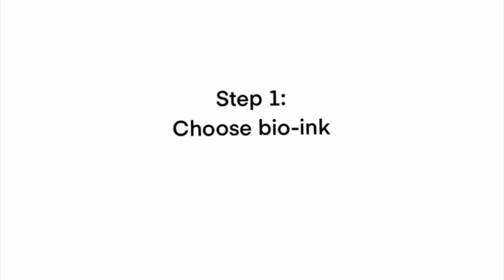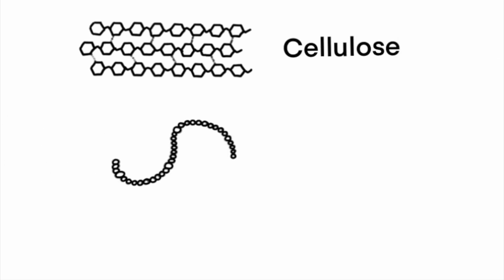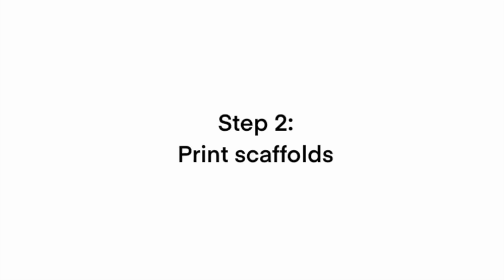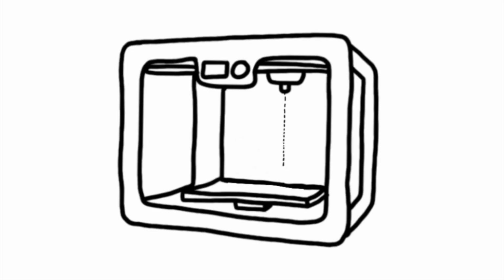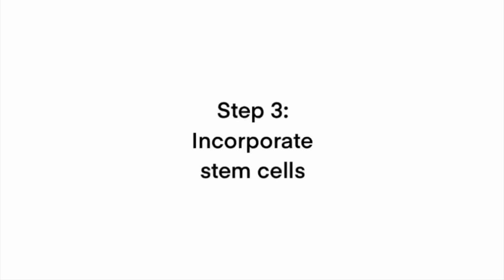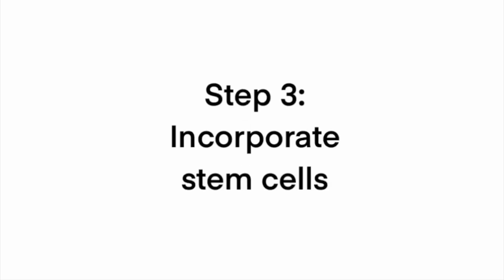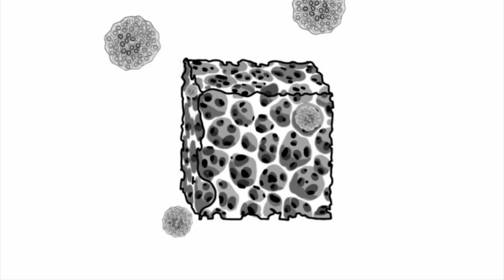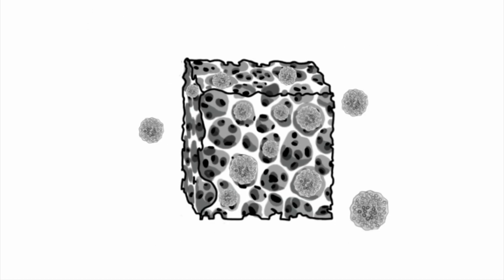Step 1. Choose your bioink. These are natural or synthetic polymers which will form the base or scaffold of the bioprint. Step 2. Print the scaffolds. Scaffolds are printed using a 3D printer and the selected bioink. Step 3. Incorporate stem cells. Stem cells are incorporated into the scaffolds, which serve as a guide by providing optimal conditions for stem cell differentiation into specialized cells and ultimately tissues.